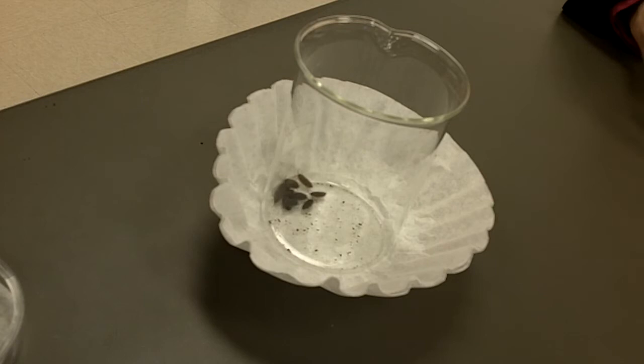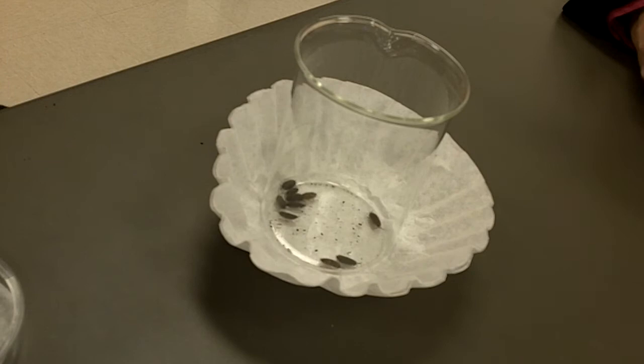Some of the babies are different and varied versus the adults. Like some of the babies are brown with a black stripe and the adults are just fully colored. They had babies last spring and the babies were white. But as we go through the semester, we'll see. Hopefully they'll survive and be okay for you all to do your experiments.